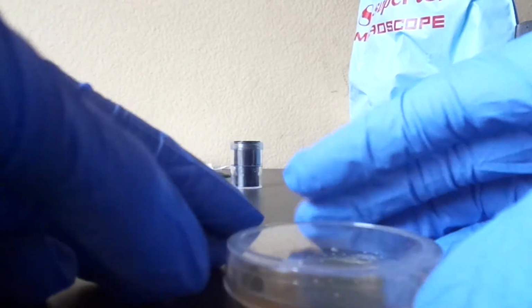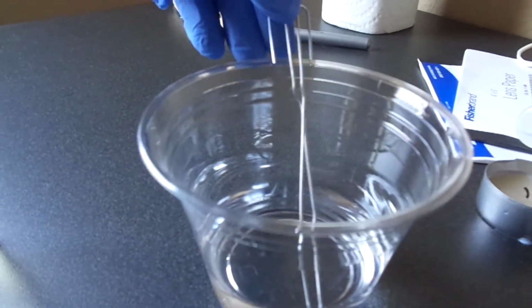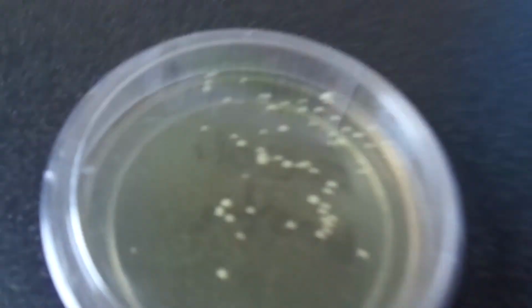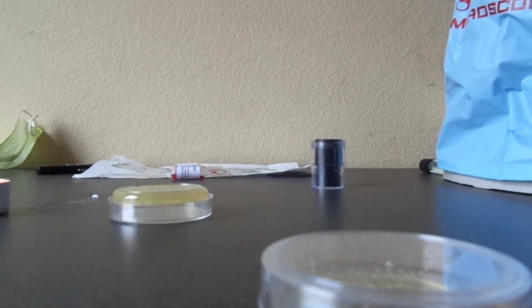So with that, I'm going to take a straightened paper clip that's sterile, and I'm going to remove a couple of the colonies here and put it into that tube to incubate for about 3 to 4 days along with my MRVP broth. So let me go ahead and do that real quick.